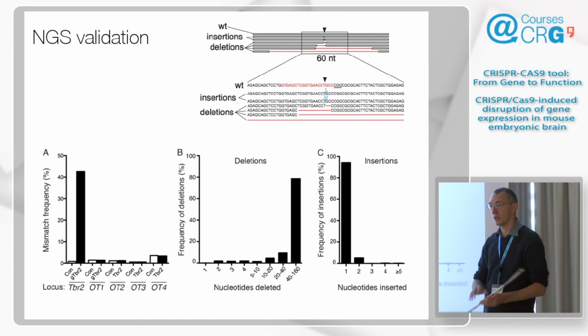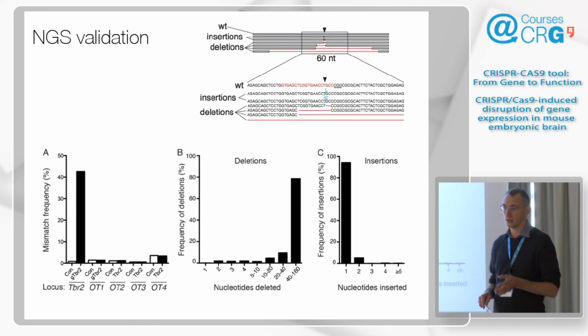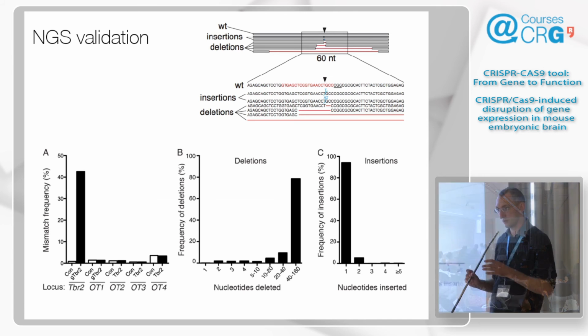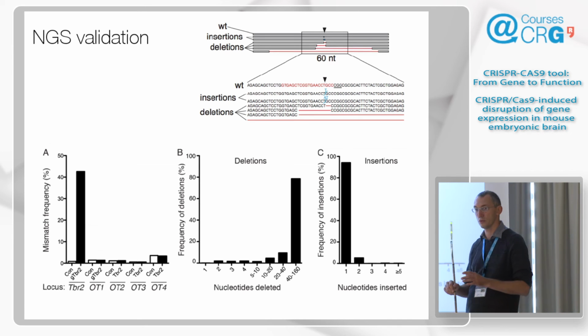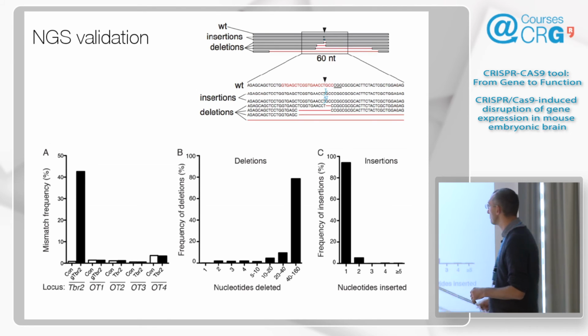We quantified this, and well, it's semi-quantitative. It's not the perfect assay, but what we did is we did PCR around the junction, and then deep sequencing of those PCRs. Now the caveat is that if there is a deletion bigger than the PCR, we will not detect those, and also it's still a high throughput technique. These are some examples, but we basically deep sequence these PCRs, and we get a lot of noise from the deep sequencing and the PCRs and that sort of stuff. So it's hard to judge what's an edit, but it allowed us to look through what the main classes are.